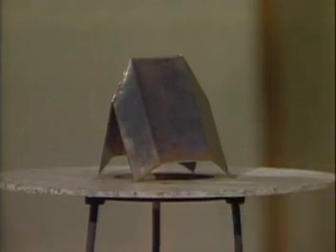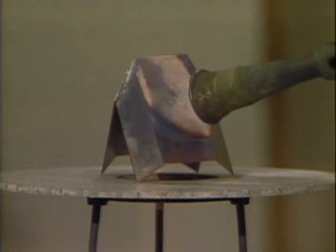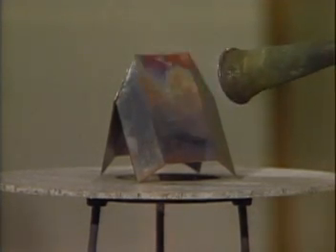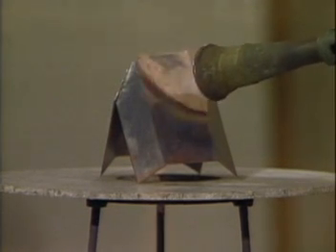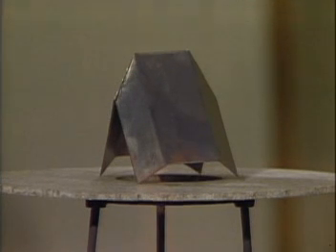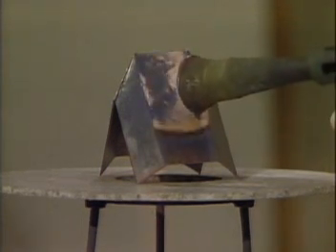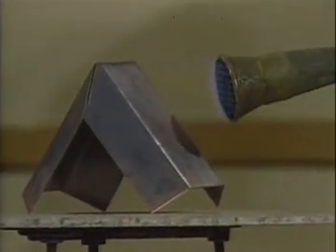Now watch what happens if I take this burner and try to heat the copper oxide from the outside. Can you see what's happening to the copper oxide? It depends how closely I put the flame to the piece of copper. That's because the flame itself has at least two zones — one is called an oxidizing zone and one is called a reducing zone. When the copper oxide is in the reducing zone, it goes back to copper. When it's in the oxidizing zone, it goes to copper oxide.